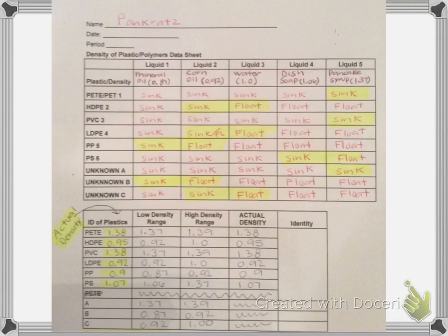And so what I did here is I highlighted over here with PET. If we look, I highlighted the sink right there. Now there was no upper end of that, so I don't really know what would have happened if I had another liquid, but I'm assuming that if I had a liquid with a higher density, I would have had a float on the other side here. So I'm not going to have an upper end there.